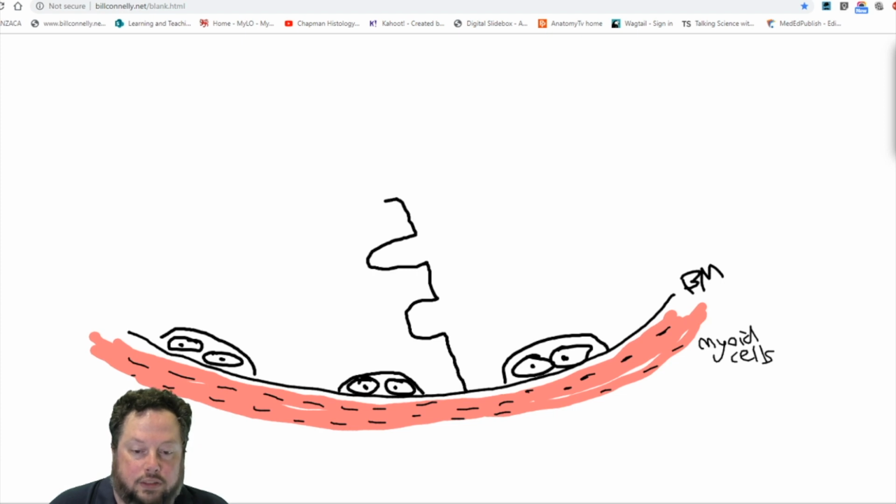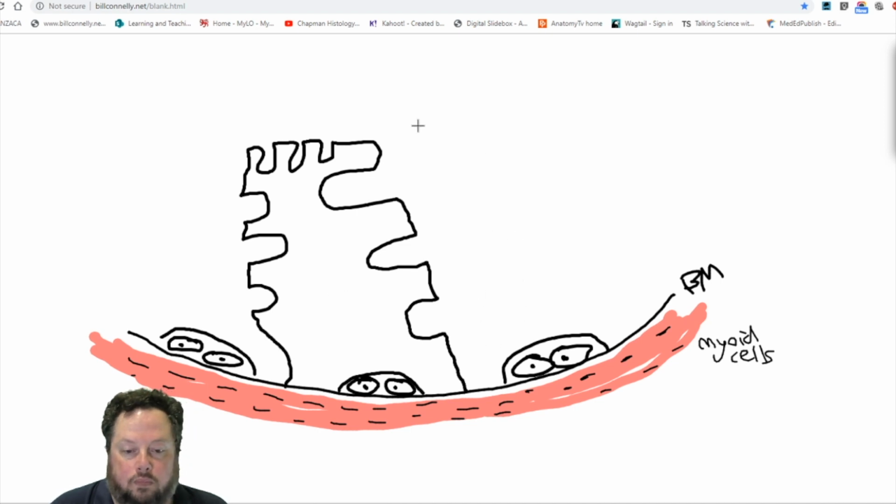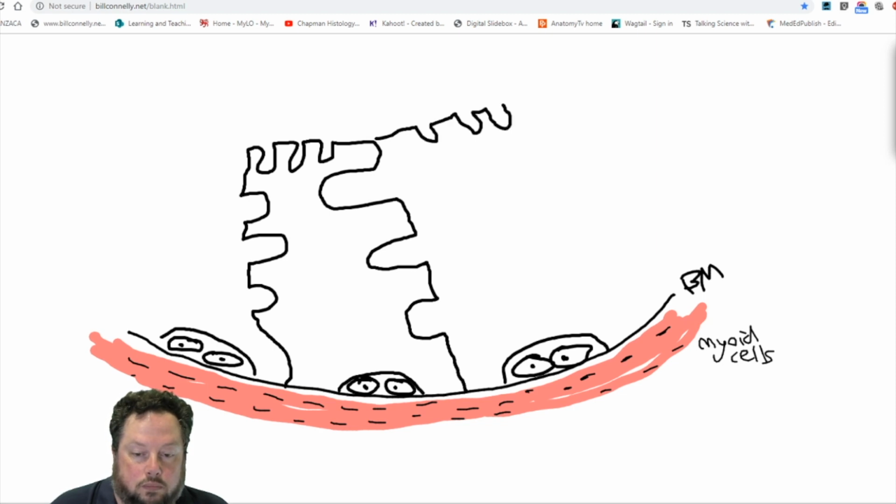Just bear with me, this is going to take a little while. Okay, so we've got another cell here.